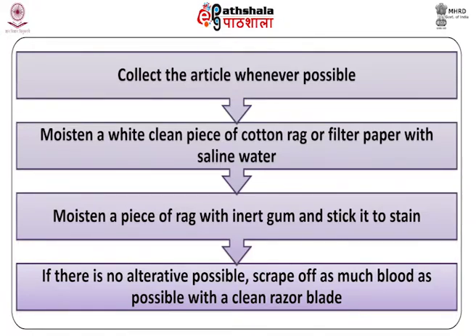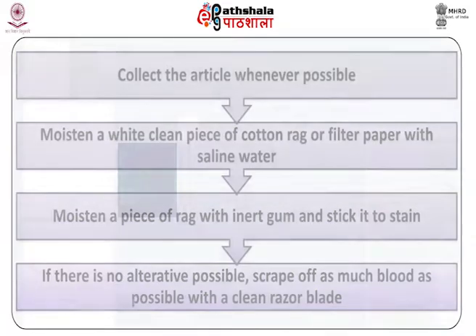If there is no alternative possible, scrape off as much of the blood as possible with a clean razor blade on a paper from the stain and pack it in a clean envelope or vial. Ordinarily, scraping from blood stain is not recommended as it is likely to result in the loss of some blood.